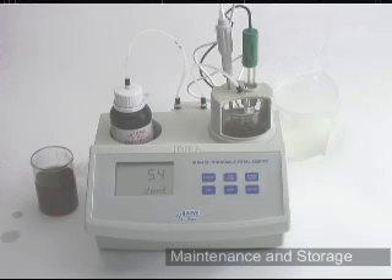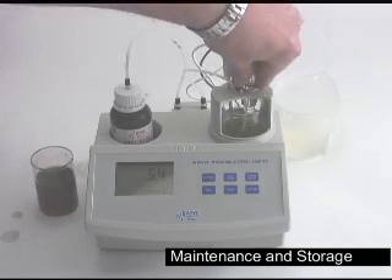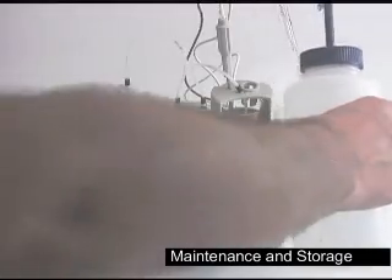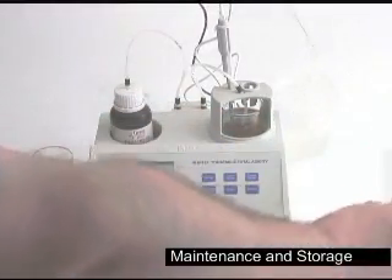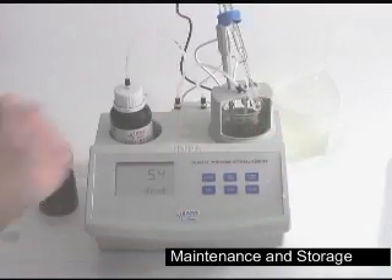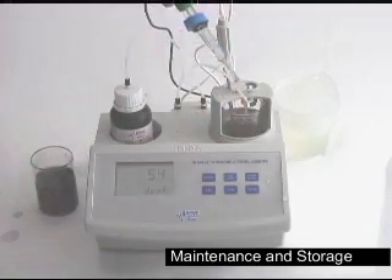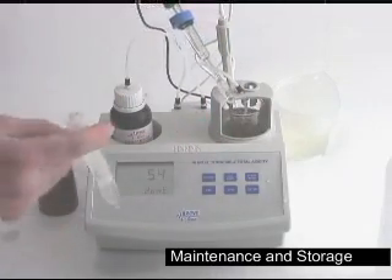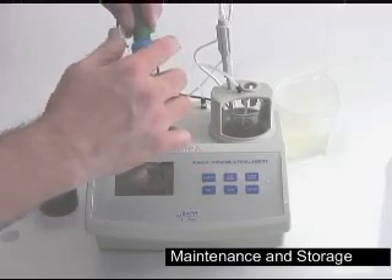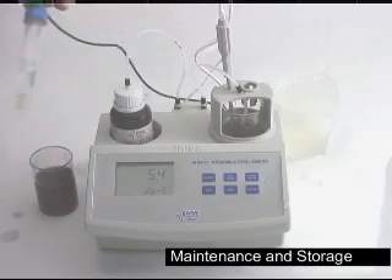When you're done testing for the day, here's how to store your meter properly. We're going to start by rinsing and storing the pH probe. Take your pH probe, giving it a quick rinse with deionized water. Place the blue cap followed by the O-ring. Make sure you have storage solution. Seal it off and you're done — you can store it in any position.